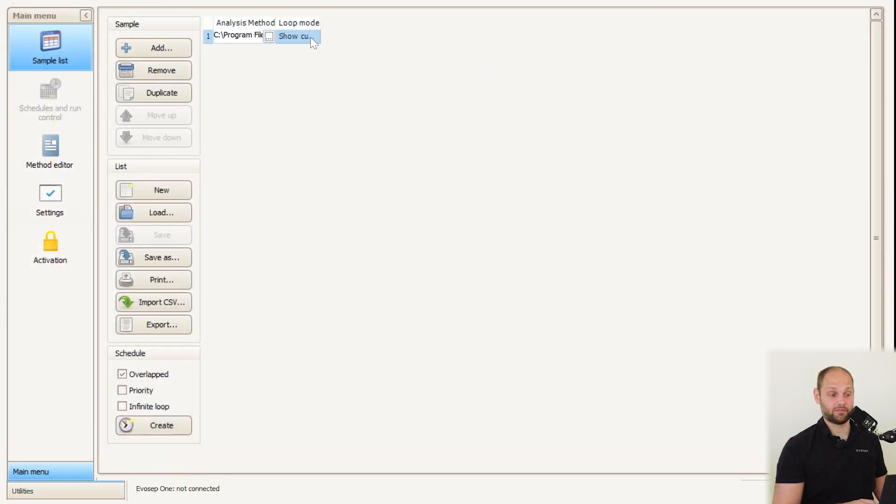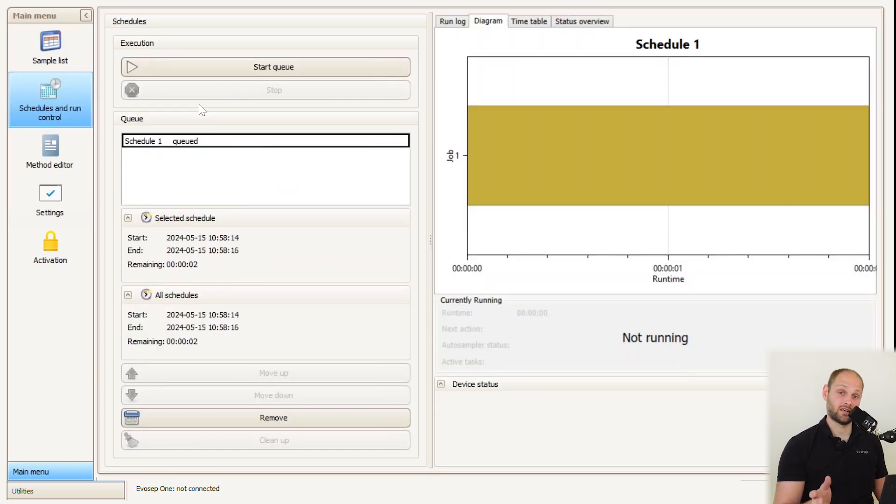With that open, the first thing you'll want to do is run the show current script within the method list. This tells us the current instrument's configuration. Here we click create and this takes us to our schedule and run control menu where we can start the queue.